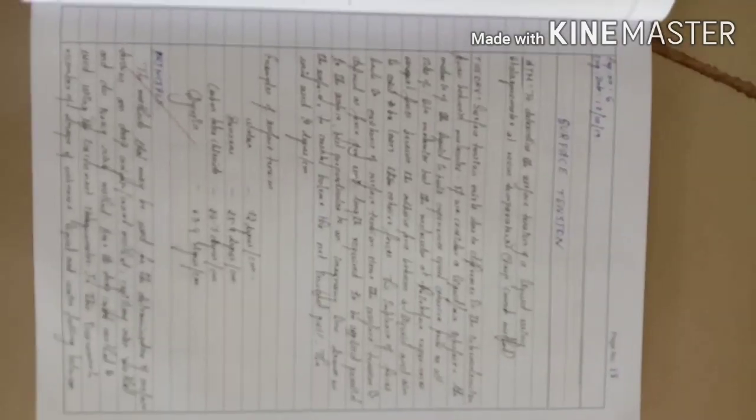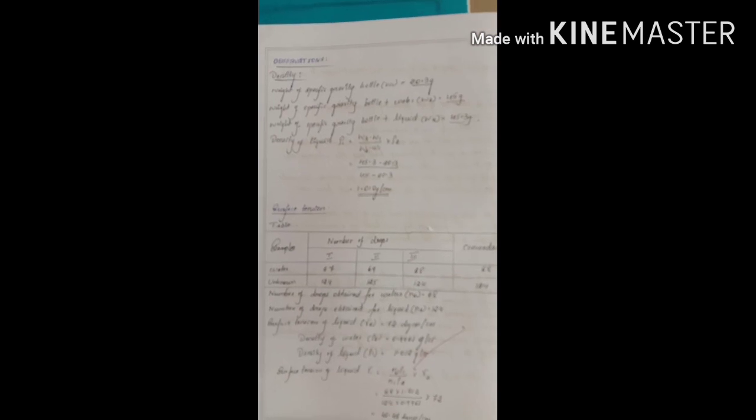Surface tension gamma 1 is equal to n2 into rho 1 divided by n1 into rho 2 into gamma 2, where 2 is water and 1 is unknown liquid.